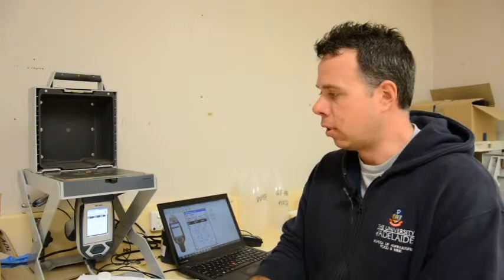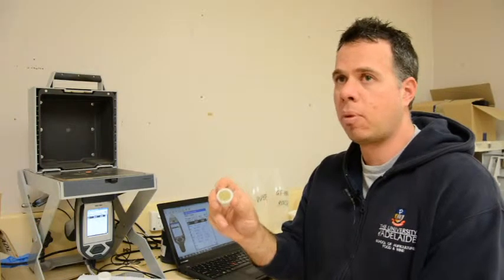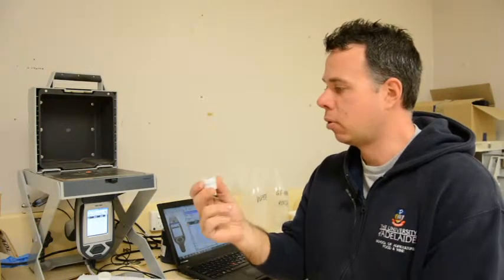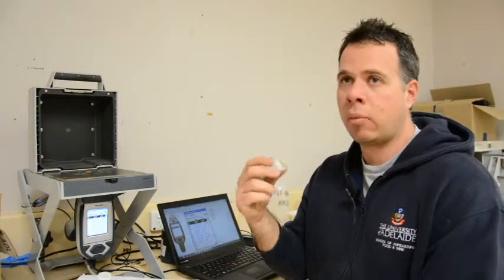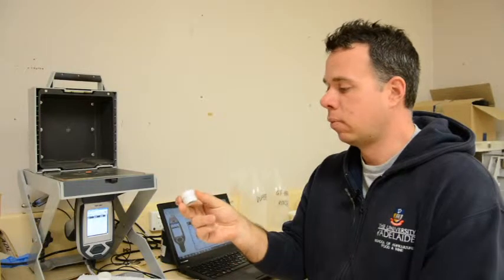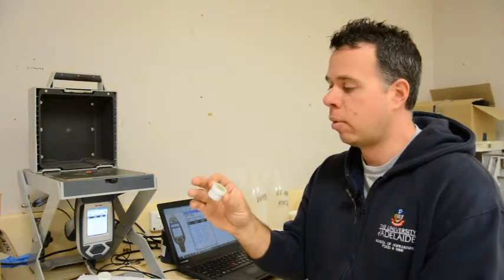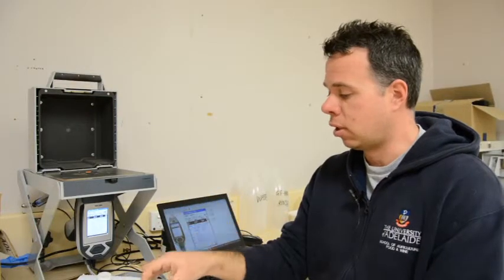So the theory is if we can do samples like this quite rapidly, it can take between 30 seconds to 2 minutes to get a result. We're cutting down that time of measurement, and also the acid digestion, labour and the costs of running the ICP. The cost of this is only electricity after the initial purchase. There's been background data suggesting XRF is really good on prepared samples, so, as you can see, ground.